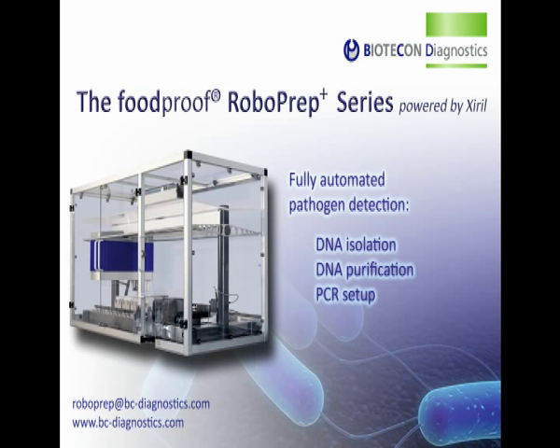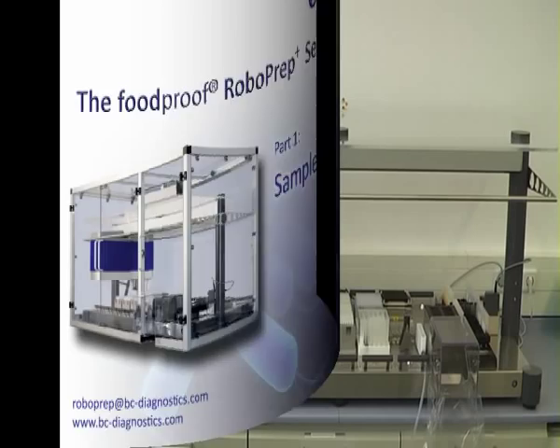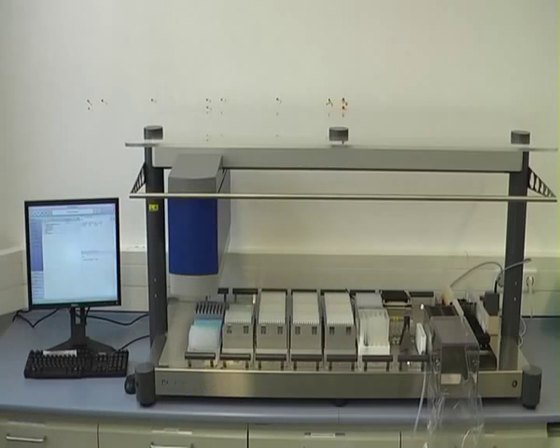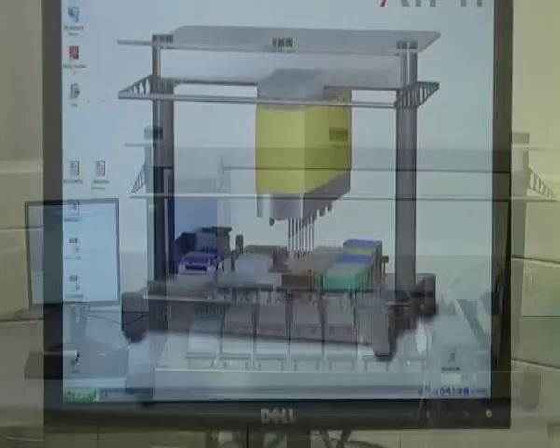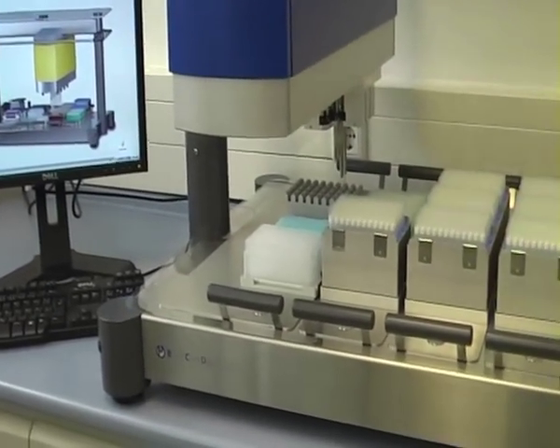The entire process, from DNA isolation to the final setup of the PCR plate, is automated, thus minimizing errors and making high-throughput pathogen testing efficient and easy. In this video, we will demonstrate the basic steps of DNA isolation and PCR setup for Salmonella detection as performed on the Foodproof RoboPrep Plus 158 workstation.